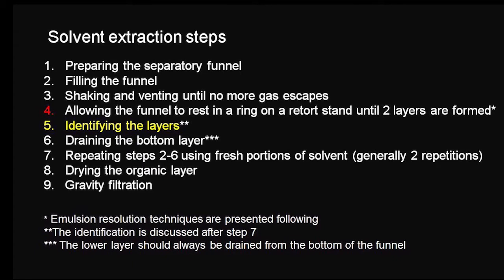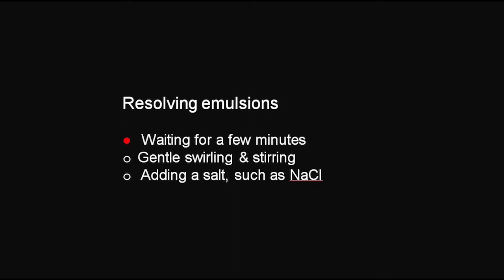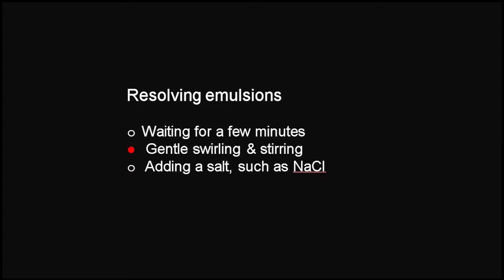If an emulsion has formed near the interface between two liquid layers, we could wait for a few minutes to see if separation will occur on its own. Then, sometimes gentle swirling and stirring is enough to destroy it.